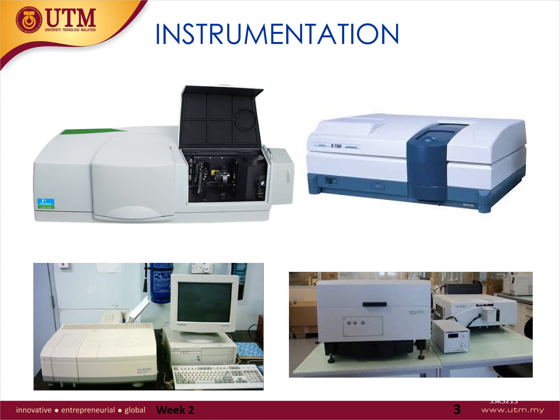So these are a few of the brands available in the world right now, and the most popular UV visible spectrophotometer is Perkin-Elmer. I'm not promoting or anything, but basically Perkin-Elmer is used largely in laboratories, in service labs, as well as in IPT. Last time we used Shimadzu, and we also have Agilent, but lastly we chose Perkin-Elmer due to its stability and so on.